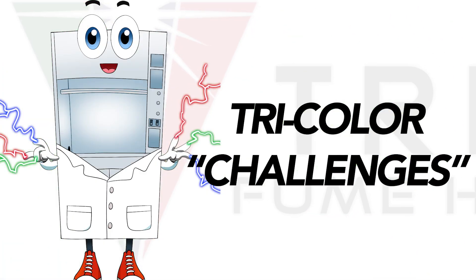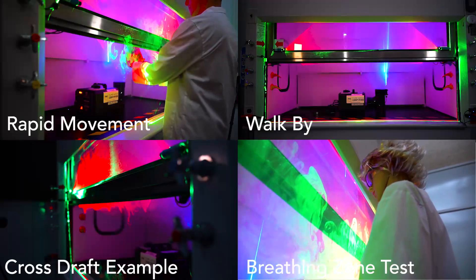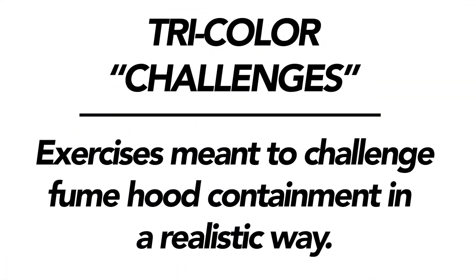The next reason is the tricolor challenges. Allow me to explain. While ASHRAE 110 focuses on more of the technical functions, tricolor focuses on real-world conditions that would be present in a lab. The tricolor challenges were designed for visualizing airflow and challenging fume hood containment in a more realistic way.